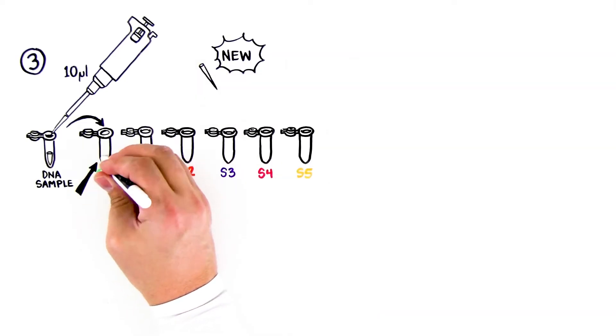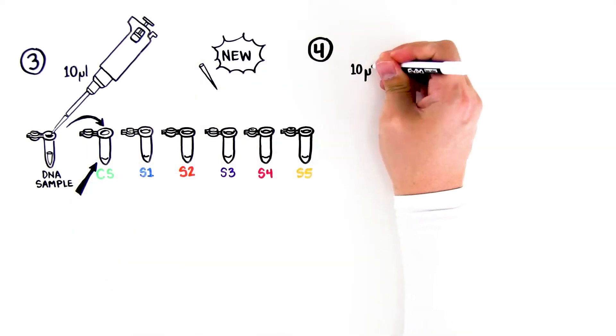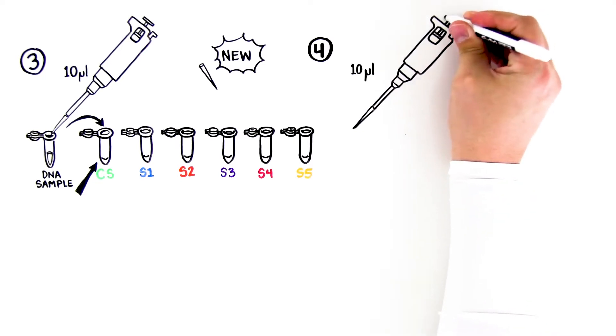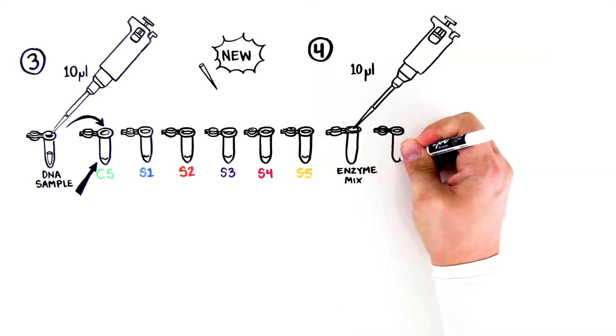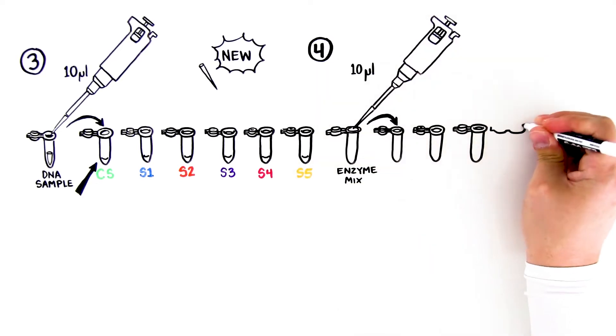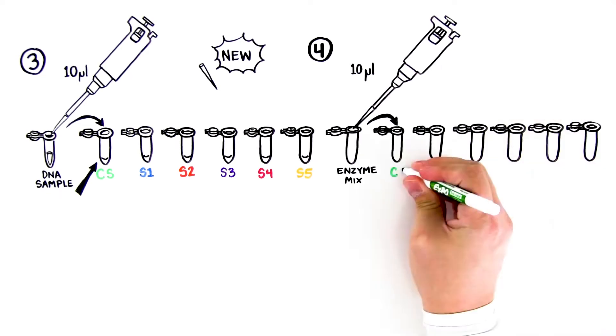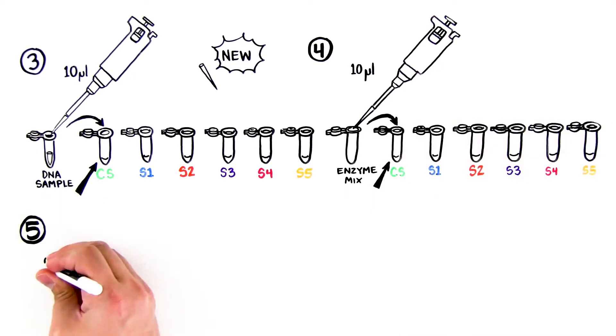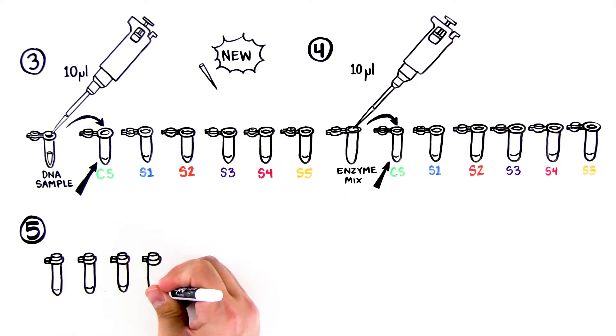Fourth, pipet 10 microliters of enzyme mix ENZ to the very bottom of each tube. Use a new tip for each ENZ sample. Fifth, cap the tubes and mix the components by gently flicking the tubes with your finger.